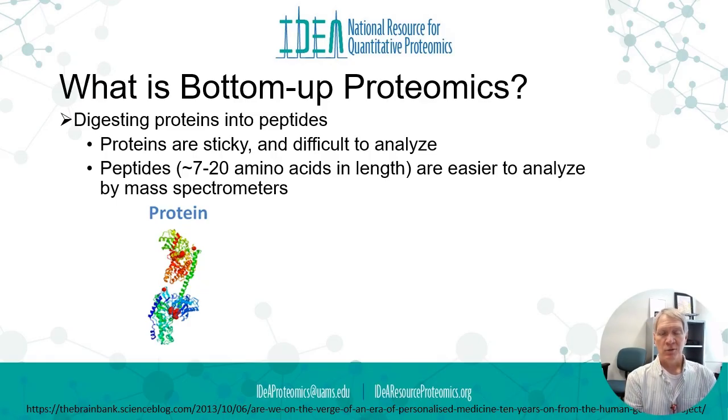Bottom-up proteomics is where we're going to study the proteome. We're going to look at all the proteins in a sample, but first we're going to take those proteins and digest them into peptides using a proteolytic enzyme. So proteins are really sticky. Think of making scrambled eggs.